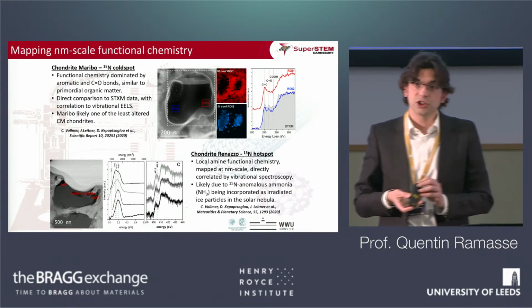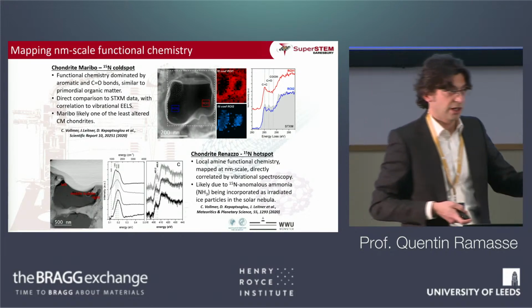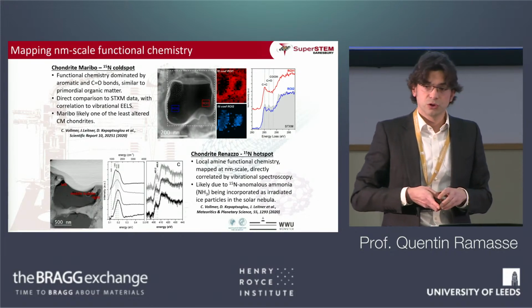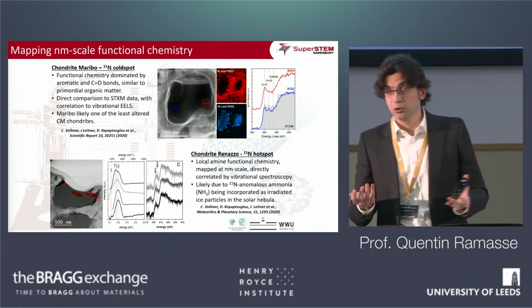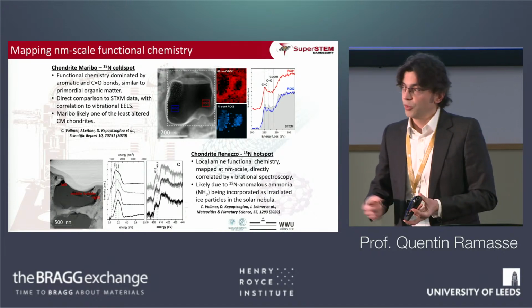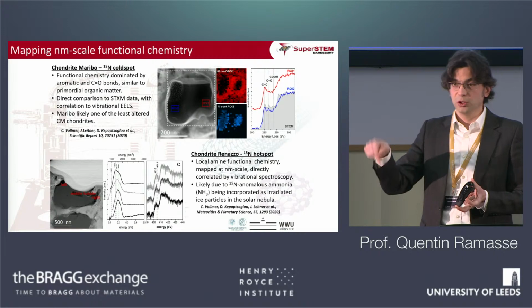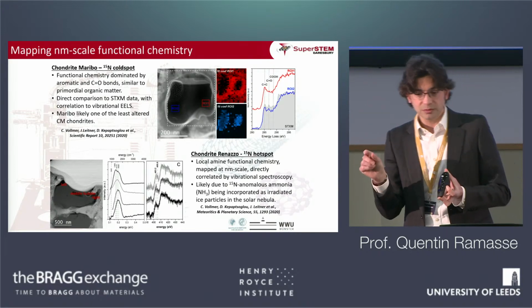So at the same position as you can look at the absorption spectroscopy, so carbon K-edge, or EELS, you can also have the vibrational response in the IR range in the same way that you would look at things with a Raman spectrometer or an FTIR spectrometer, but this time with the exact same machine, because you have those extremely narrow incoming energy resolution.